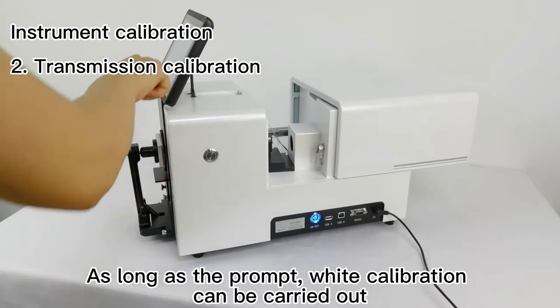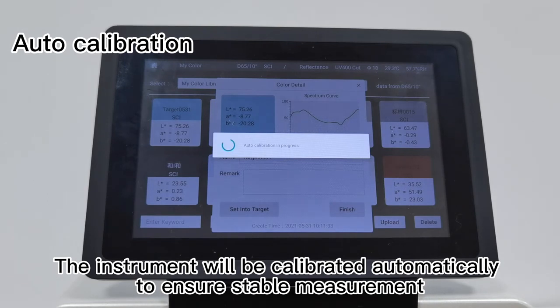Live auto calibration: The instrument will be calibrated automatically to ensure stable measurement.